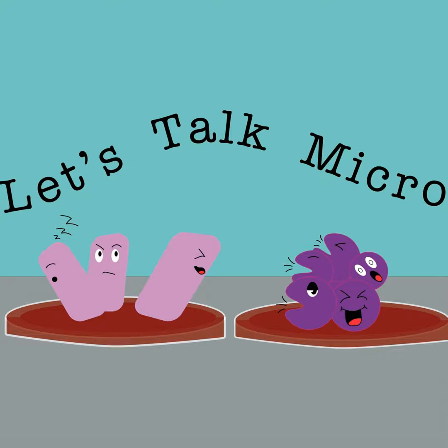So I started studying up and researching everything. The initial training that Nanopore provides was the first introduction, and they introduce you to all the different terms, like FASTQ, FAST5, and so on. It was a great introduction.